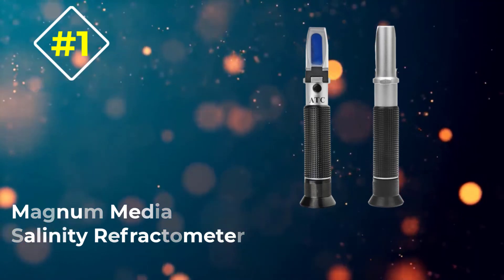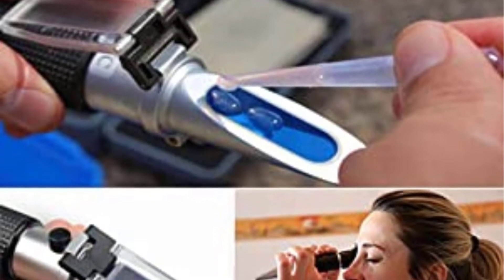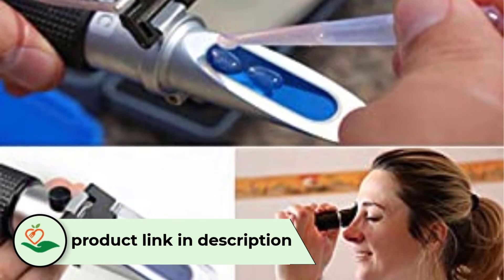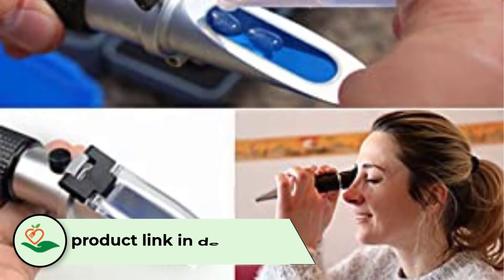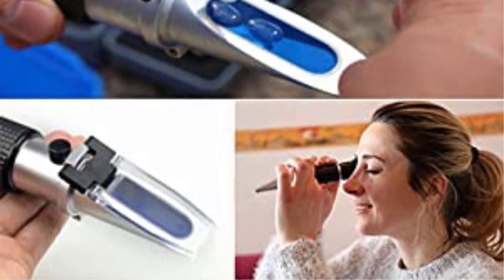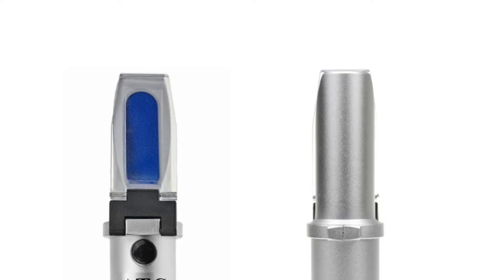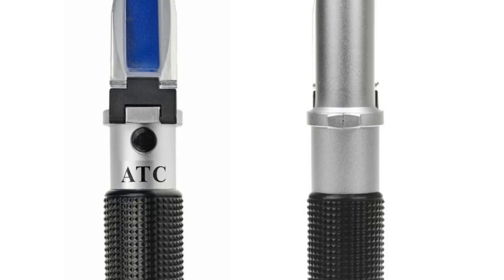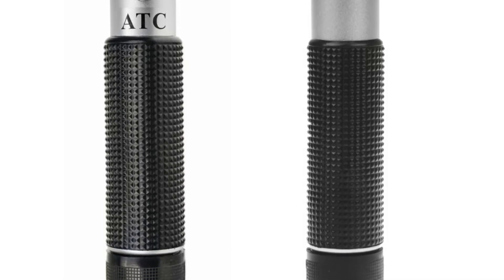Number 1: the Magnum Media Salinity Refractometer. This is a no-frills, portable-use refractometer made for marine studies and educational purposes. You may be surprised at the power this battery-free device can offer. It looks like a telescope and is small enough to clip onto you. Once you have acquired your sample of water, place two or three drops on the prism, wait 30 seconds, and you should have an accurate readout.